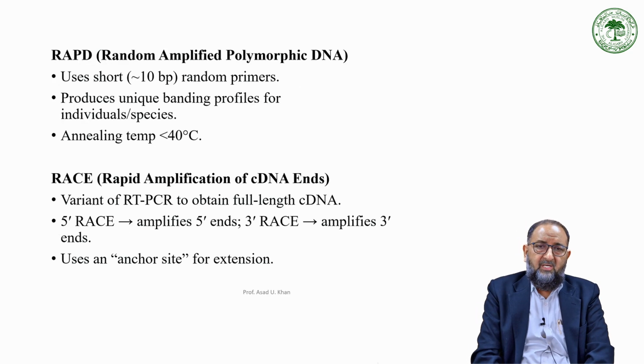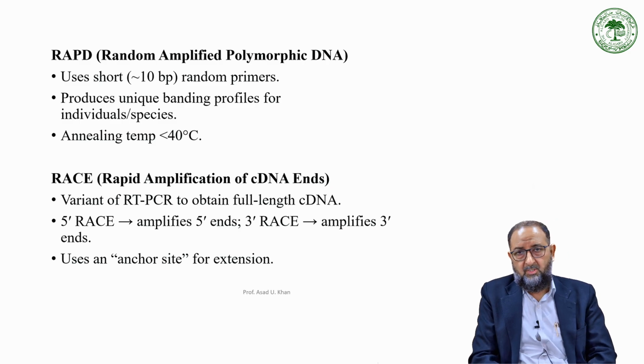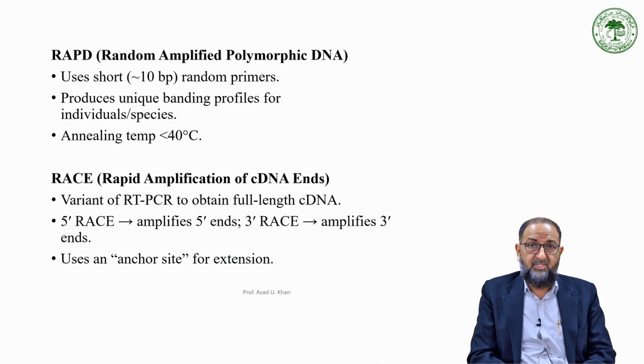Now we have many different variations of PCR, which we call marker and typing methods, or gene marker identification, using different types of PCR. Though the PCR reaction remains the same, we name them differently.